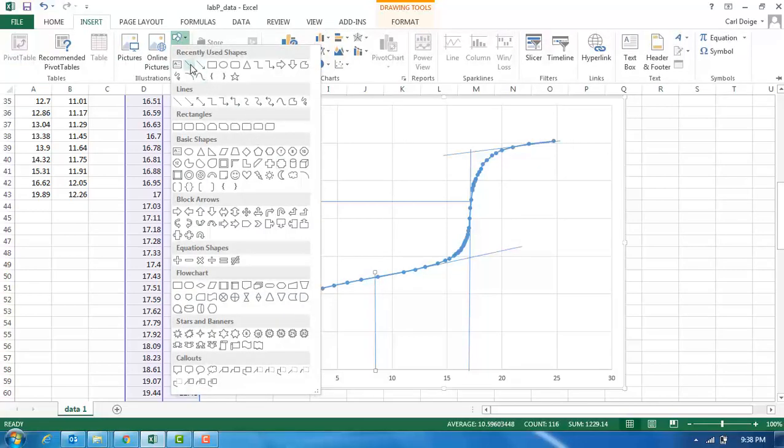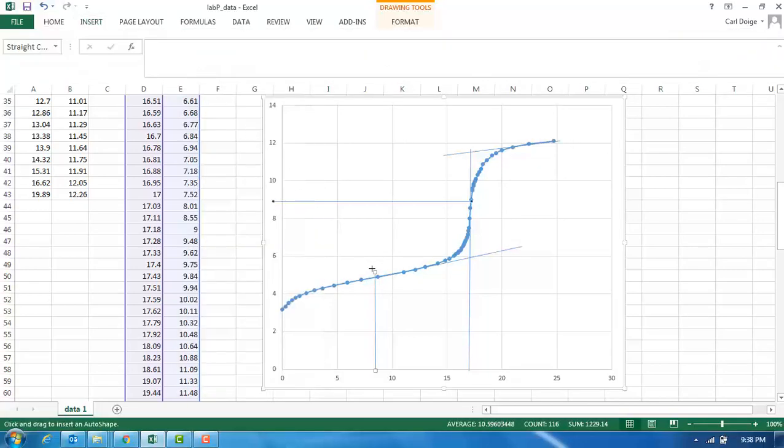And so once again I'm just going to show you what we're aiming for. We're not going to be able to read the point off directly from the graph because the graph doesn't have enough level of precision. So I'm trying to draw the best straight line I can. There we go. Okay, so roughly speaking, the volume halfway through the titration is at about 8.57 mils. I'm interested to know, well, what is the pH that corresponds to this 8.57 mils?